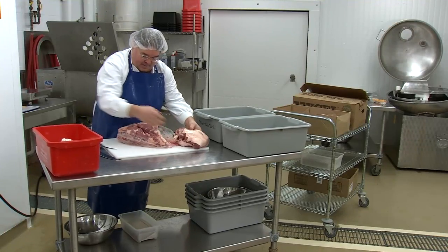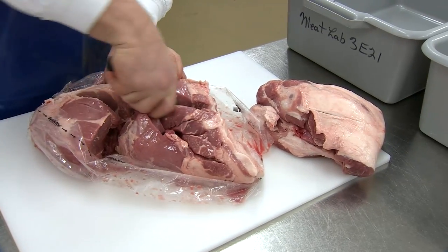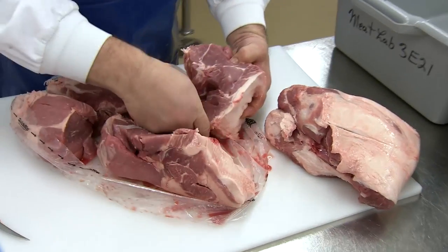Initial quality checks include temperature, meat colour and odour, and also looking for any obvious defect in the meat. In today's formulation, pork shoulder will be the main meat.